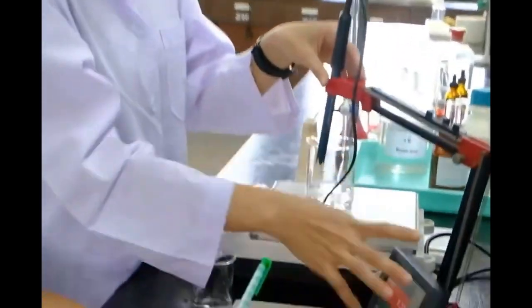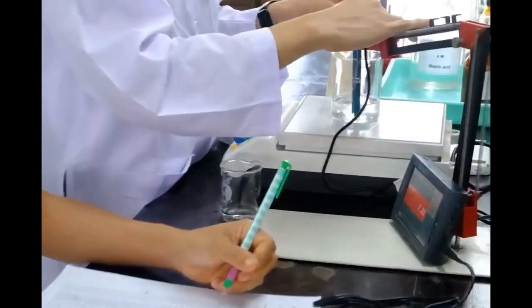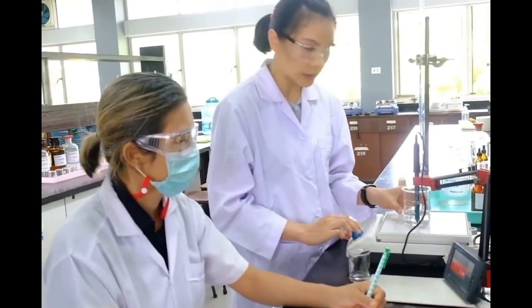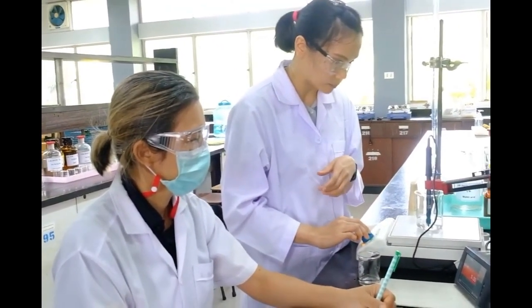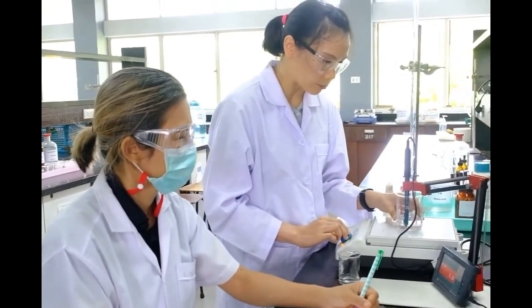Immerse the pH probe in the maleic acid solution. Next, turn on the magnetic stirrer so that the magnetic bar inside the beaker containing the maleic acid solution rotates. While the magnetic bar is rotating, observe carefully to prevent it from touching the pH probe.